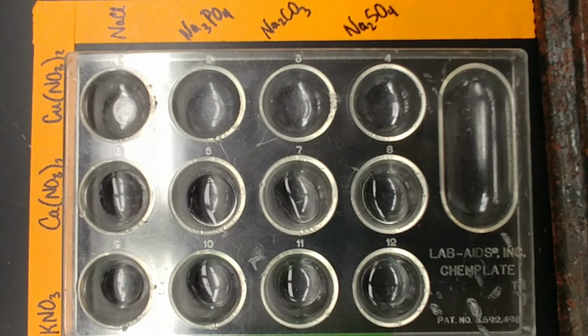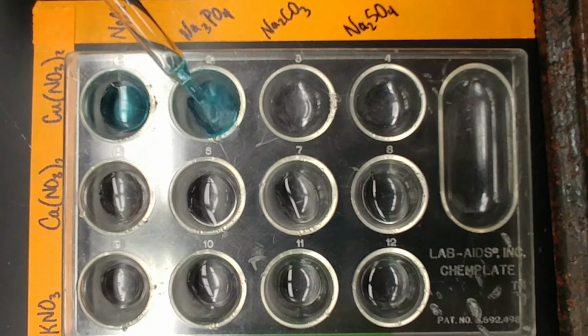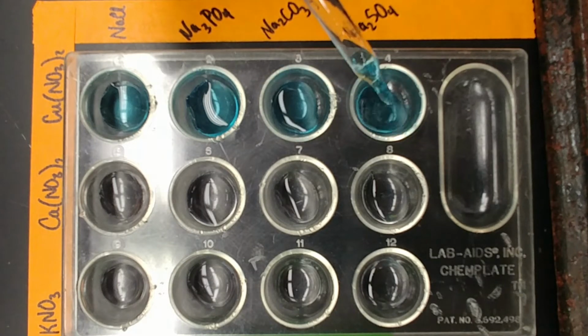Next is the copper 2 nitrate. This one contains a transition metal, and as such it is a blue color. Many of your transition metals are going to be the components of compounds that give things color.